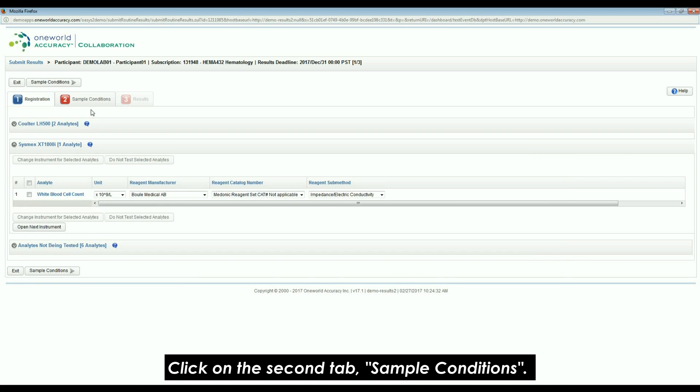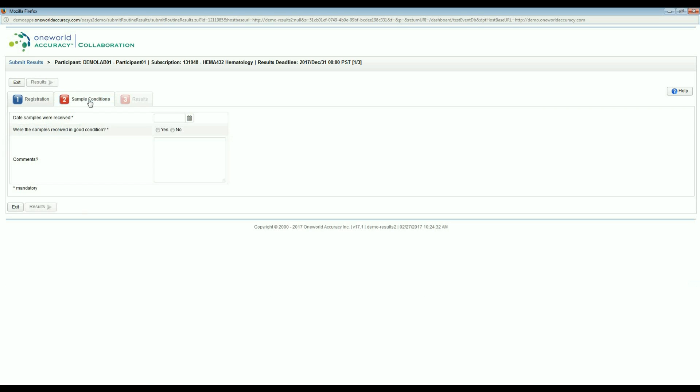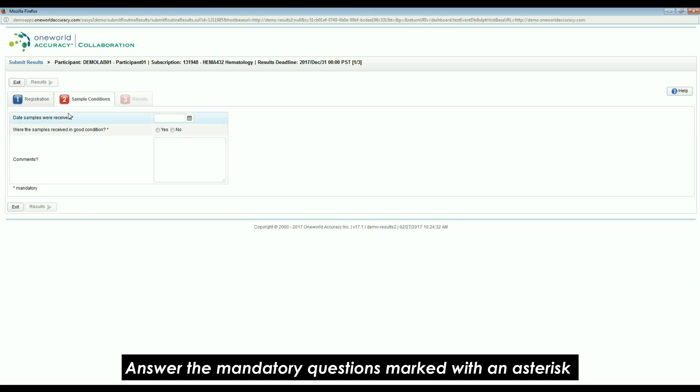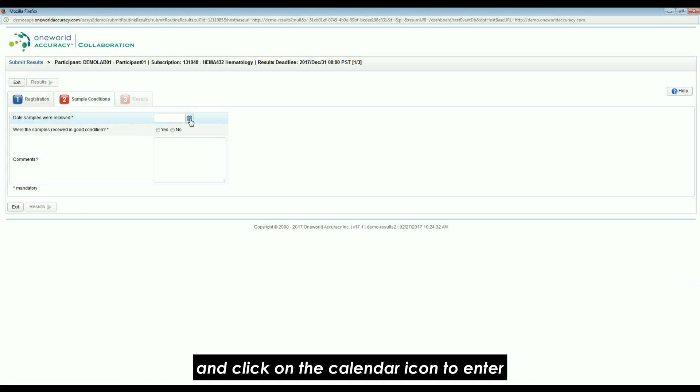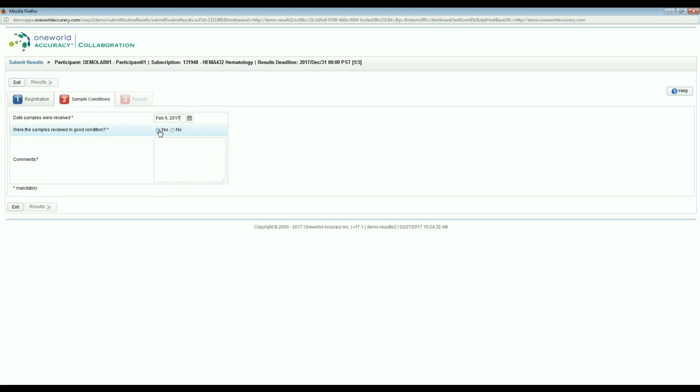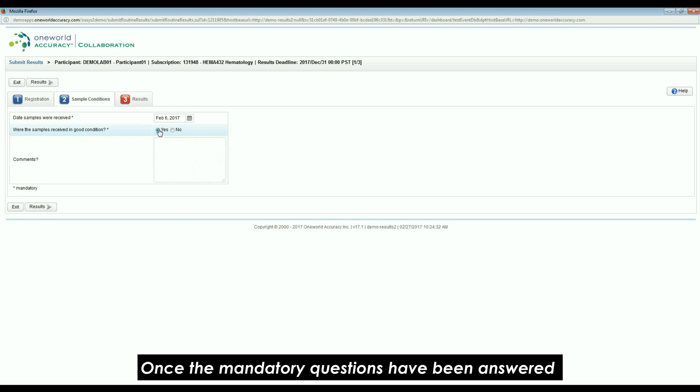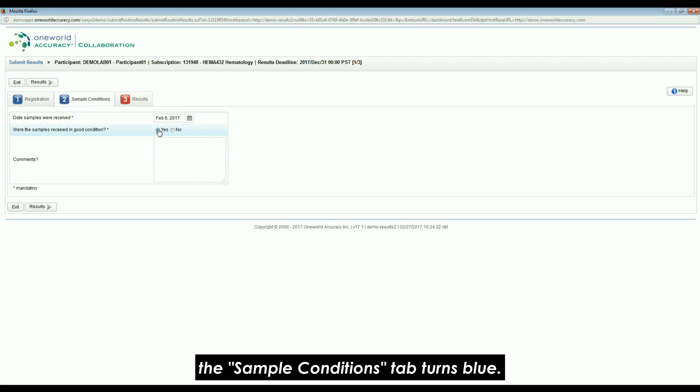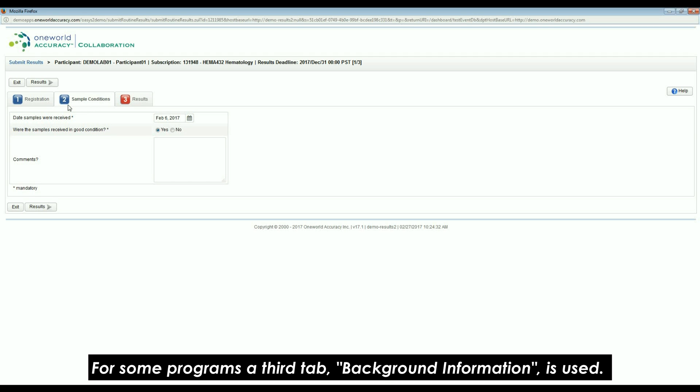Click on the second tab, Sample Conditions. Answer the mandatory questions marked with an asterisk and click on the calendar icon to enter the date when you received your samples. Once the mandatory questions have been answered, the Sample Conditions tab turns blue.